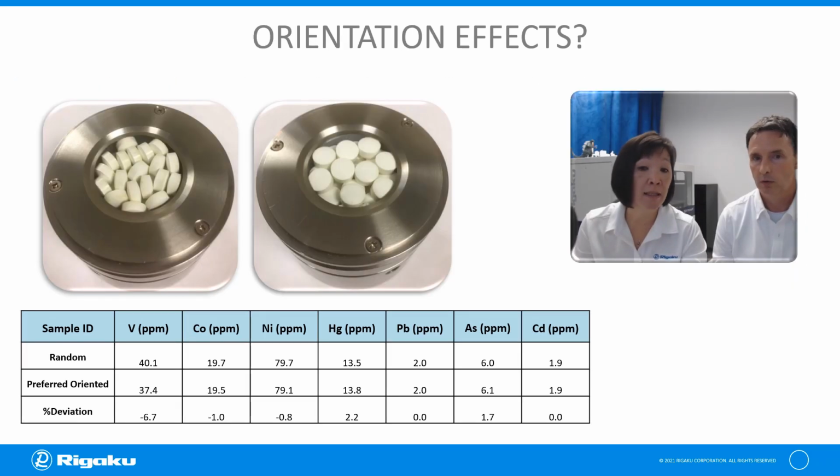Then what about orientation now? We also tested just laying it all flat evenly, or laying it all on the side, to see if there were any effects. As you can see, we do not see any difference depending on how you put it in. So the overall conclusion is you can just pour directly into a cup and analyze them as is.